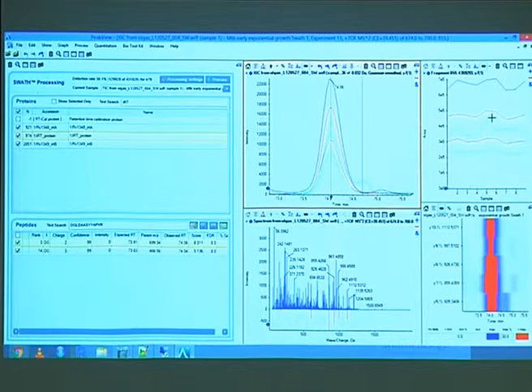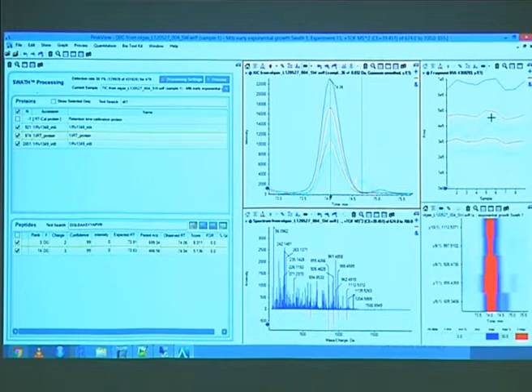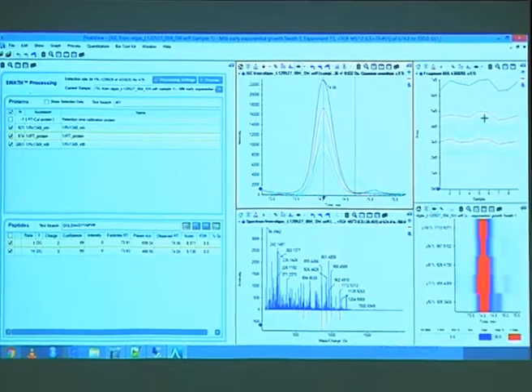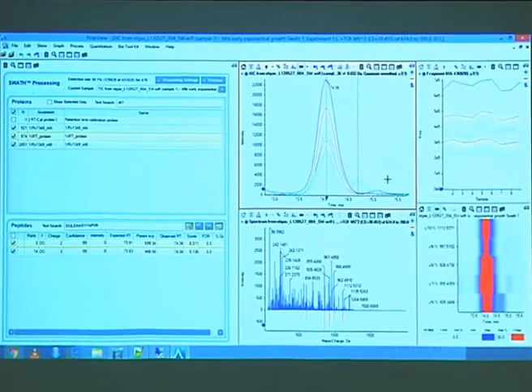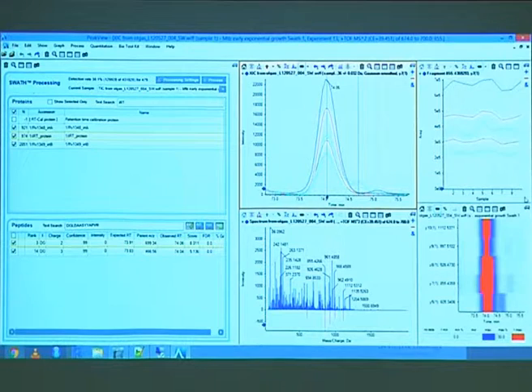You see here there's some variation, specifically in that turquoise one, or whatever that color is. That's because here you see that shoulder peak. And so this is file number 1. These ones here, for some reason they could just put numbers there.